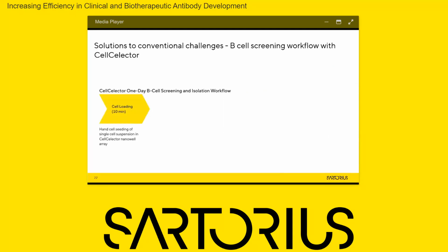Here I'll go over the B cell screening workflow to be used with the CellCelector Flex. If we start here with the first part of the workflow, that's the cell loading, it takes approximately 10 minutes. So this is the hand cell seeding of a single cell suspension into a CellCelector nanowell array. Following on from that, you would get to the single cell screening section, which is 15 minutes.